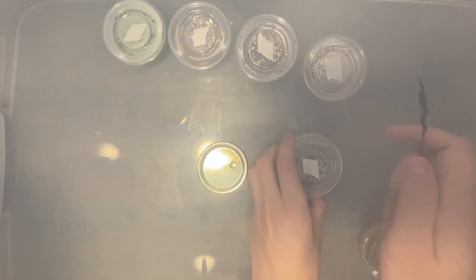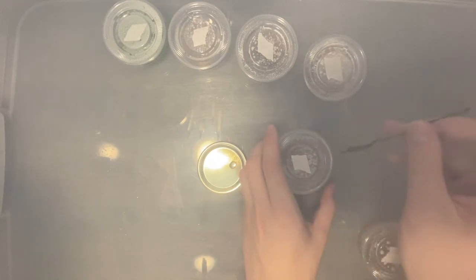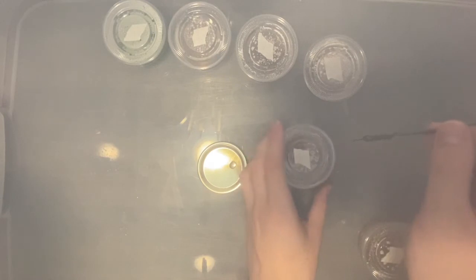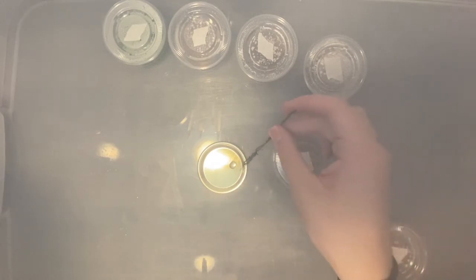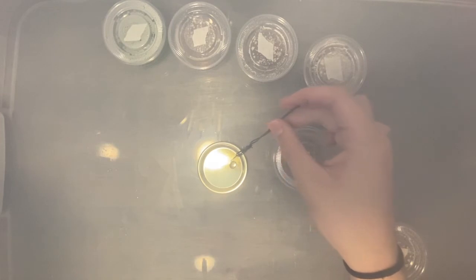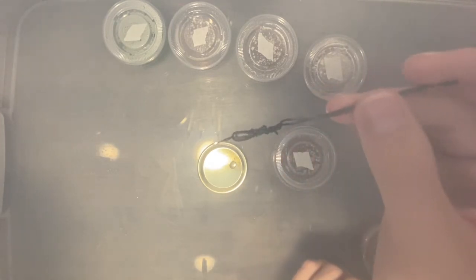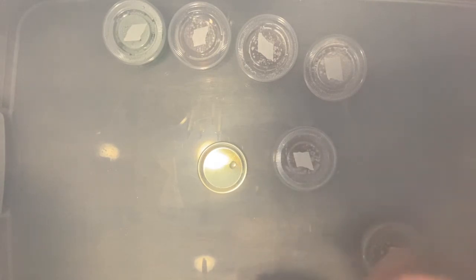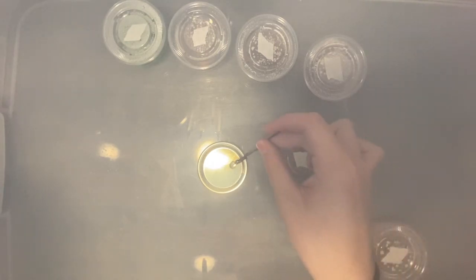And now just to cool this off quicker because I'm impatient, I'm gonna dip it into the agar. All right, now that I know that that's cooled off, we're gonna drag it through, see if we can pick up some spores. I don't know if you guys can tell, but there's a little bead of water in there. So we're gonna do that one more time.